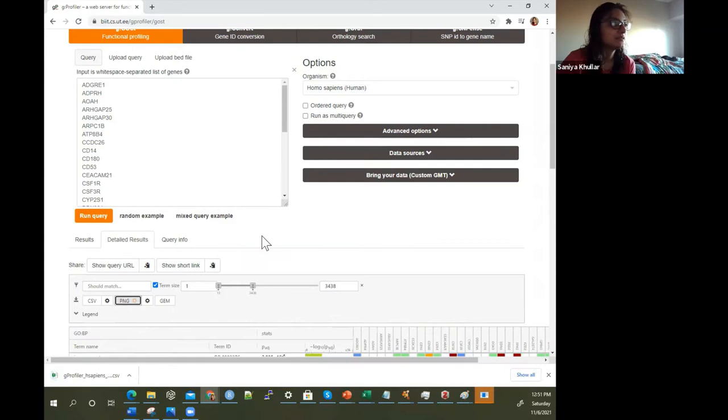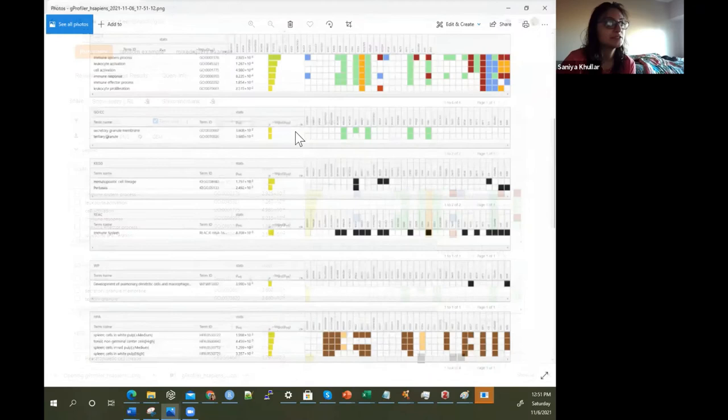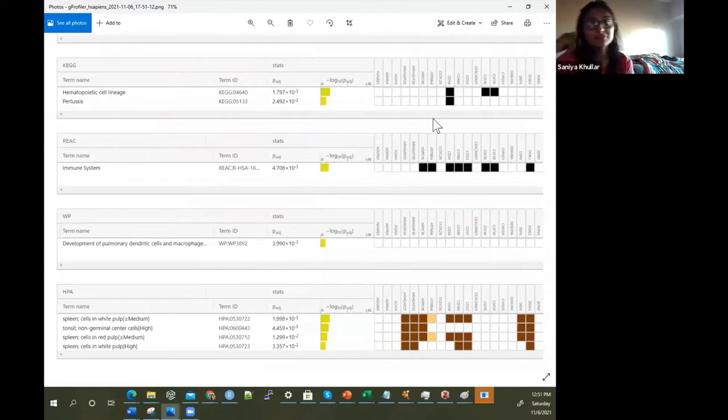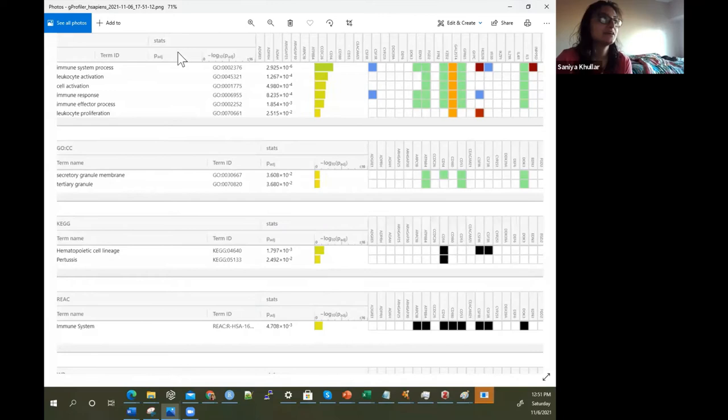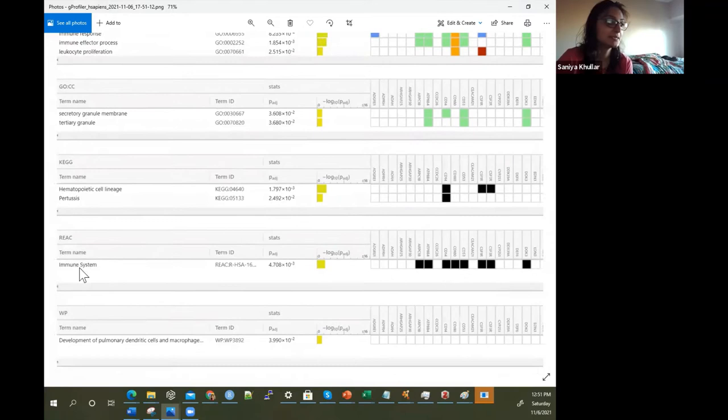If you click on PNG, you'll have photos that pop up — a screenshot of all of these results. That's a great way, especially if you just want to at a glance have these insights on what processes are enriched.